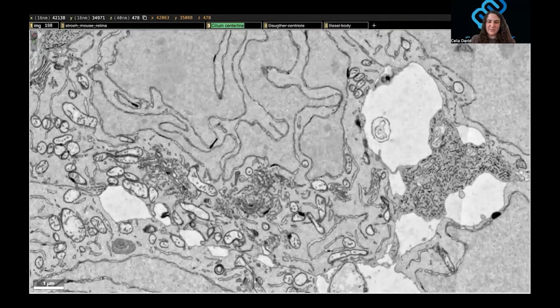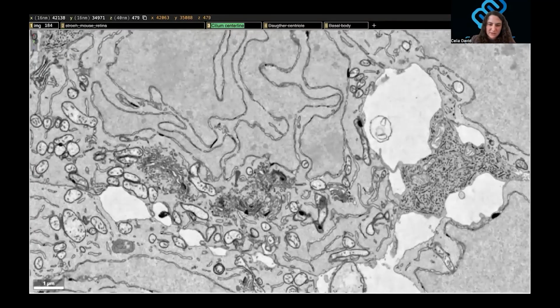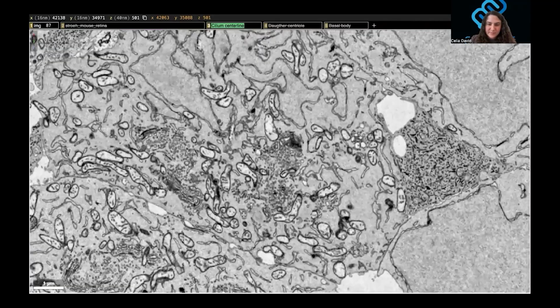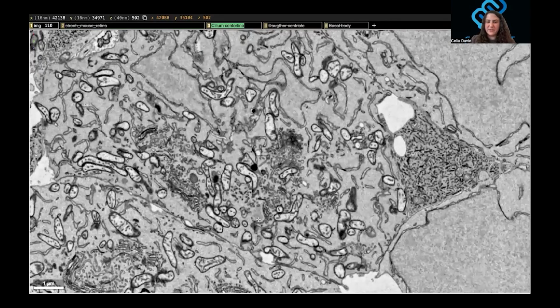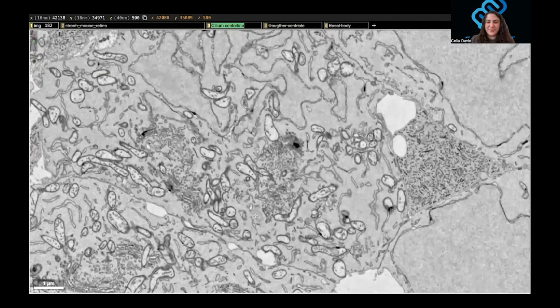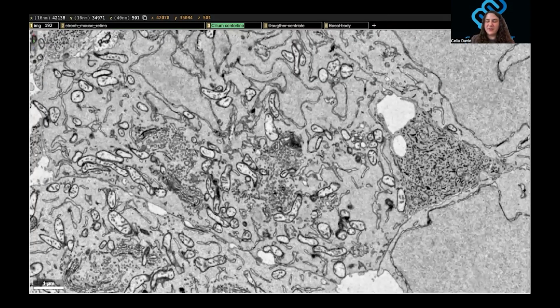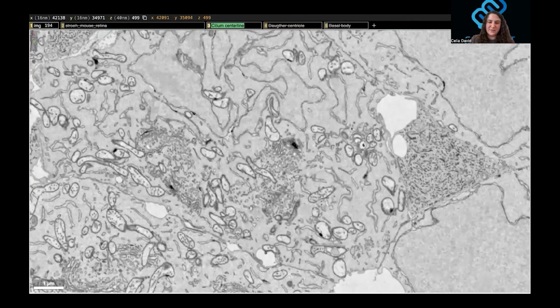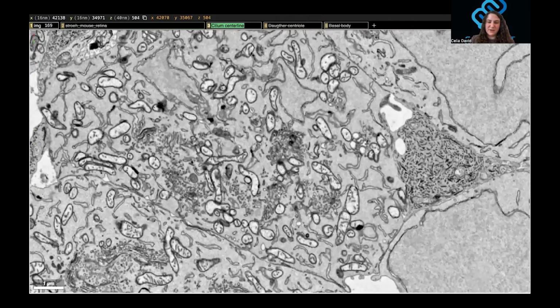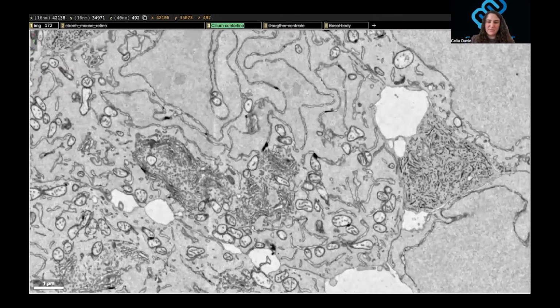And then if I keep scrolling, see if I scrolled in the right direction, maybe I didn't. Okay, so here's the other one over here. One's not as obvious, but since there's two of them, hopefully you can at least locate one and then the other one is usually nearby. So this is the other one. It's kind of a more oblong shape. It's going through more slides, but you can see it over here as well. And then the more obvious one is right here.